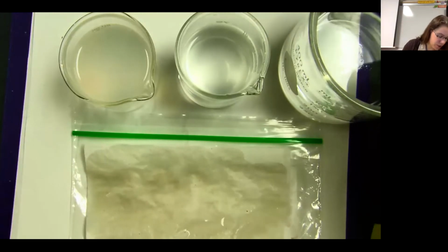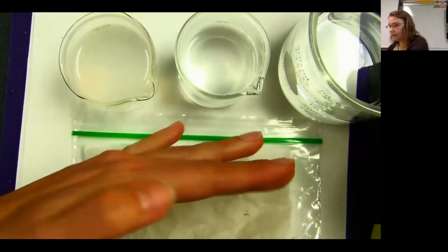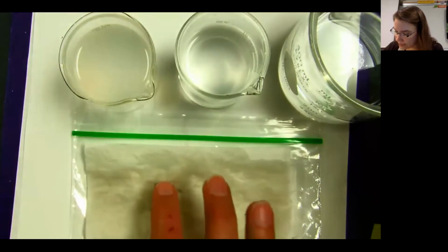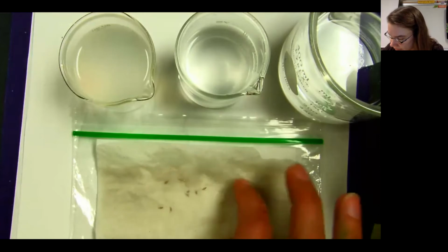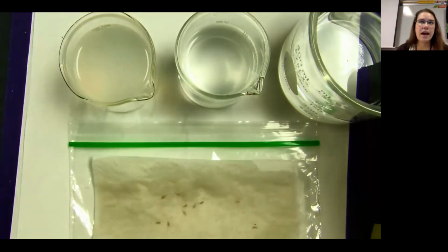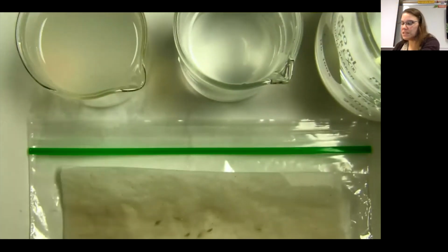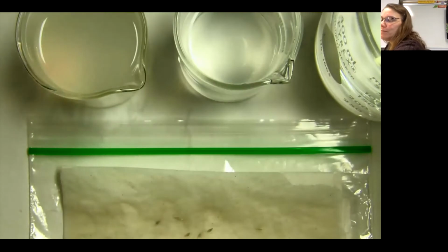Onto that, I'm going to add 10 lettuce seeds. Kind of make them stick down. Make sure that they're going to stick, they don't fall over everywhere. Now, the lettuce seeds are mixed. They are from my garden, so they're mixed with some garbage, like just some plant material.